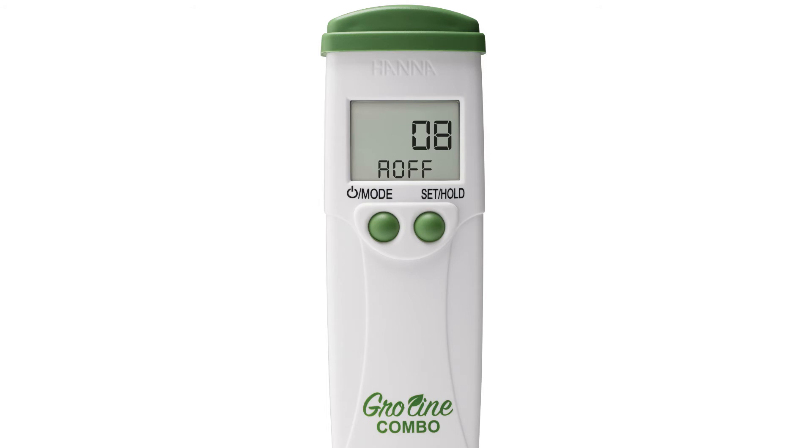Pressing the set hold button will let you choose between eight minutes, 60 minutes, or if you prefer, you can turn the setting off completely. Press the mode button once you have your preferred setting to return to measurement mode.